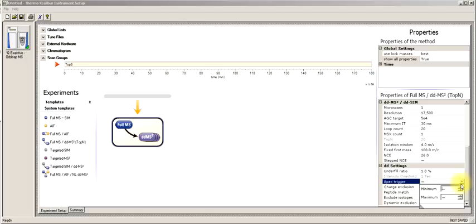Apex triggering is on the LTQ and hybrid instruments. This is the chromatography function, and this has been improved and simplified in an attempt to allow you to perform your fragmentation of your ions near the apex of the peak. And so what ends up happening is the first time an ion is selected for an MS-MS event, that ion is continually monitored for an increase or decrease in sensitivity.